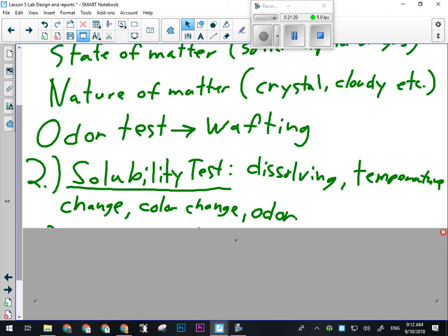So you press that and then you put it into the solution, and it'll tell you how conductive it is. Let's say anything 7 or higher is highly conductive, and as a result, indicative of what kind of compound? Ionic. I would say anything 4 or below would be considered a poor conductor or non-conductive. You will actually get some where all you'll see is the on light. They'll be that non-conductive. There really should be nothing in the middle. It'll be pretty obvious whether it's ionic or molecular with that test.